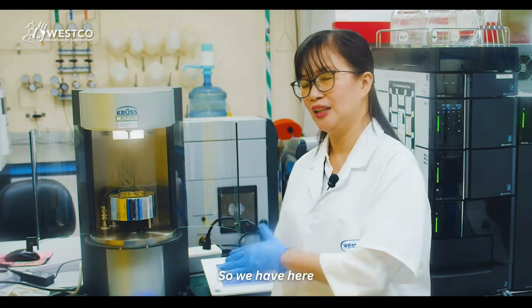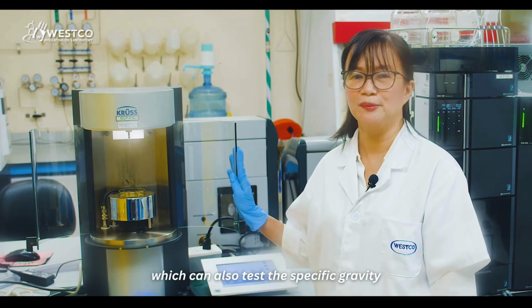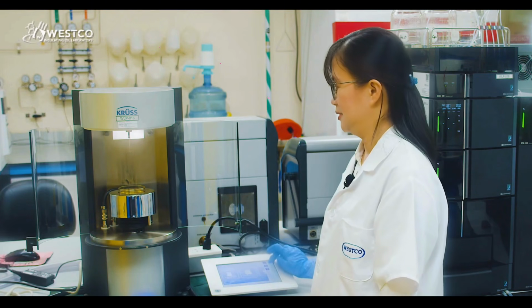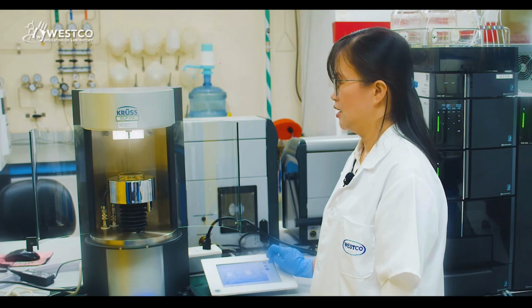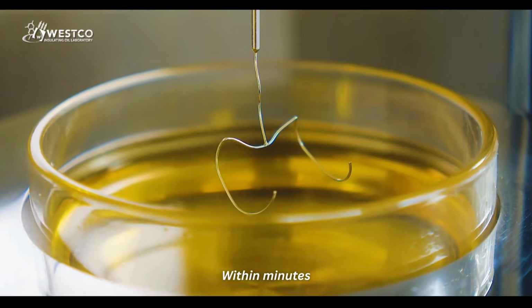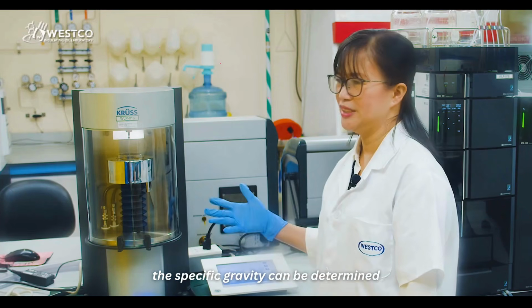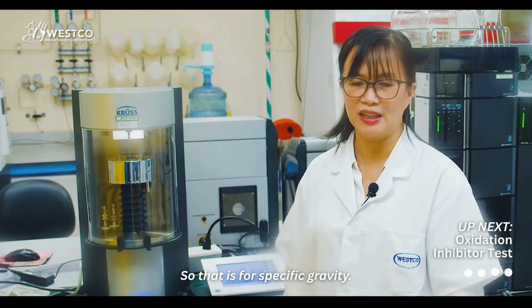So we have here in our laboratory a force tensiometer which can also test the specific gravity. Following the procedure in the equipment manual of our tensiometer, the specific gravity can be determined in minutes using this equipment. So that is for specific gravity.